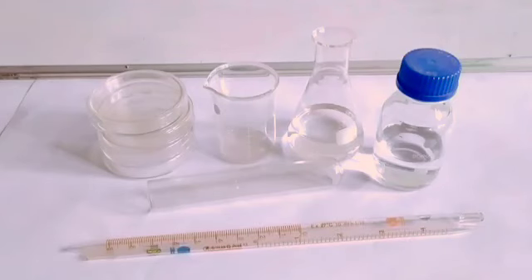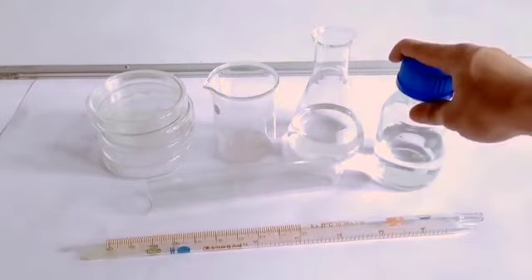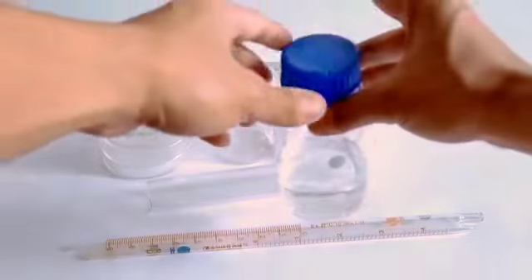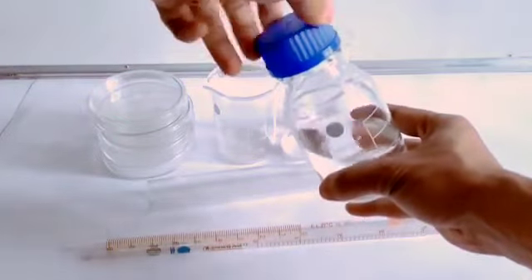Before we begin the sterilization, we must first process the items to be sterilized. I've brought together here an assemblage of some of the most common lab items that are routinely sterilized for culture experiments. In the case of screw cap reagent bottles containing liquid media, the cap must be loosened to avoid pressure buildup and potential explosion during sterilization.